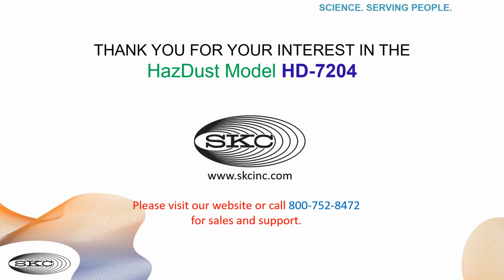And we have another question. Ready, Sandy? I'm ready. How often is factory calibration recommended? We recommend an annual service and calibration. If for whatever reason that's not possible, if you're in the middle of a project or something like that, you can always use the calibration span reference, and that will let the user determine if the instrument is still within plus or minus 10% of factory calibration.